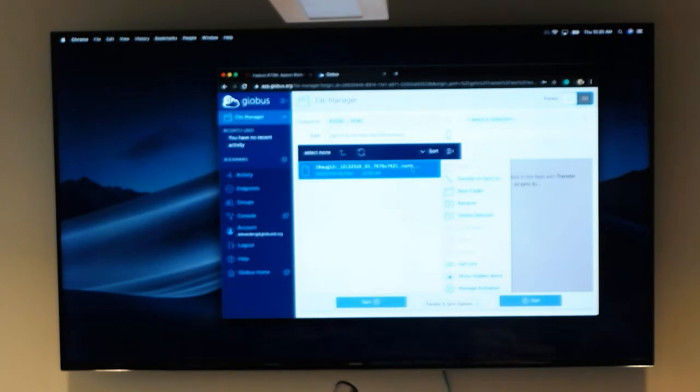The norm mod has been flip rotated with respect to the mounting of the camera, so it will match your movies directly. Each of our microscopes may have a different mounting of the camera, therefore they might have a different flip, rotation, etc. So the mod version, the norm mod, is matched directly to the movie stack. In case there's something wrong with the script, we also have the unmodified version. So that's in your frames folder.